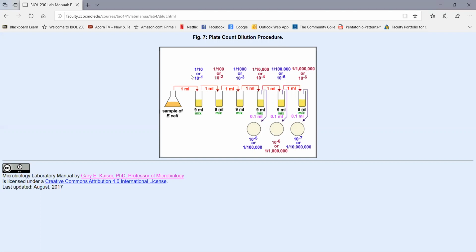So we're going to use the first 1 mil pipette to do all of these tube-to-tube dilutions till you get all the way down to the 6th tube. Then discard that pipette in the beaker we use for discarded pipettes and swabs. And you're going to take a second 1 milliliter pipette, a new one, and use that to put 1/10 of a mil of bacteria from each of the last 3 tubes onto the corresponding Petri plates.